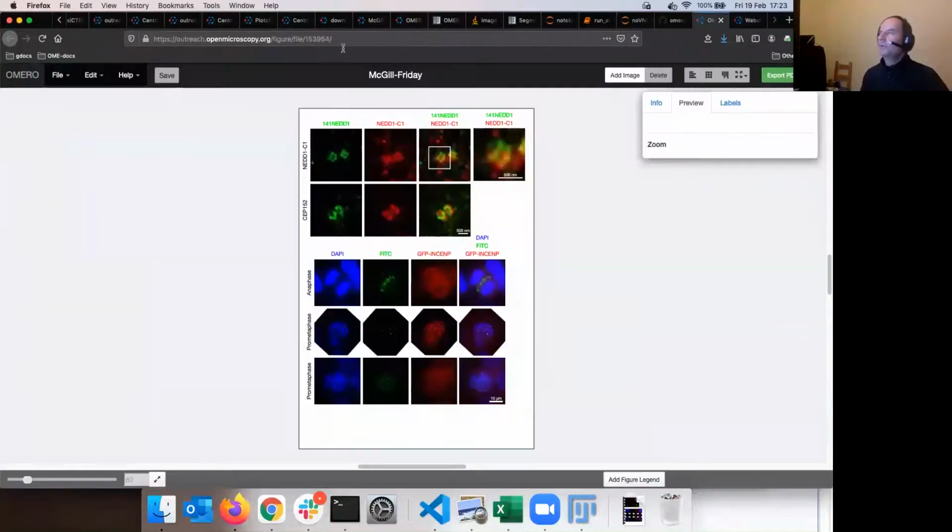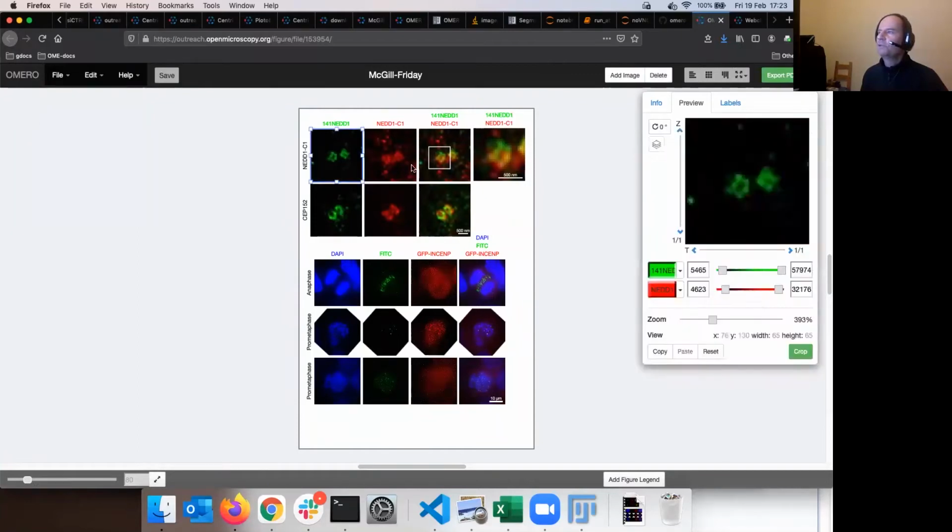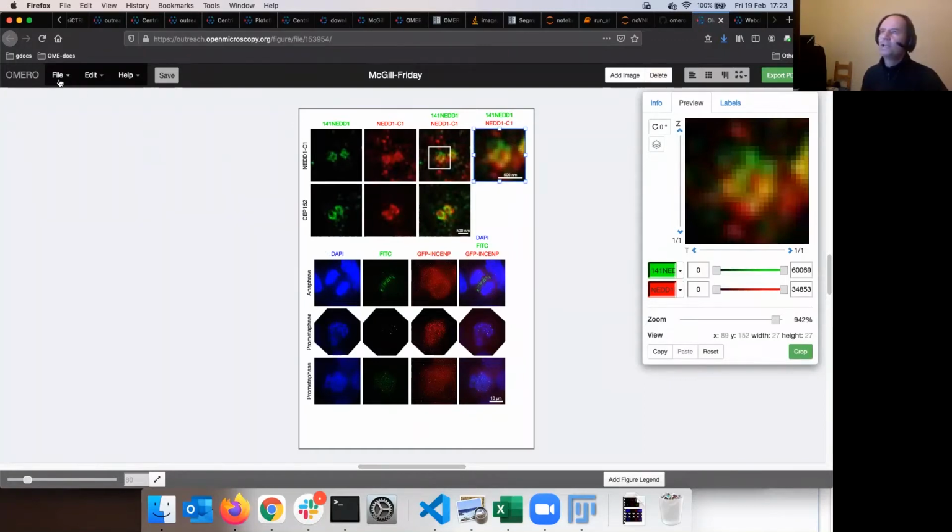furthermore, if you go back to OMERO.figure, which we just saved here, what was saved is not again some proliferation of images and their duplication, clogging your server and taking away too much space. No, OMERO.figure was saved as a lightweight thing. It's kind of a recipe which just remembers which images should be in those panels and what metadata are supposed to be shown.